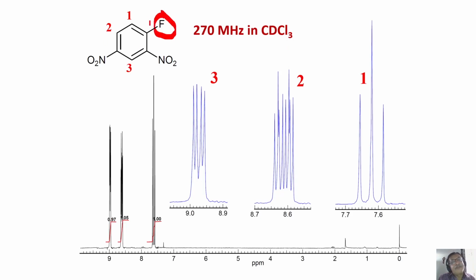But what happens if I say fluorine resonance? You get only one peak, one chemical shift, only one fluorine is there. But there is a splitting because of this and this. Very easy then to analyze. This is a doublet because of this, a doublet of doublet because of this, and doublet of doublet because of this. So if you see the fluorine resonance, similar to this, you will get 8 peaks. And you can analyze that and get all the 3 couplings with that.